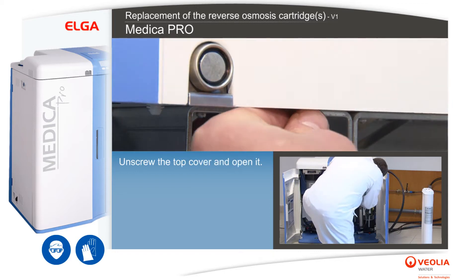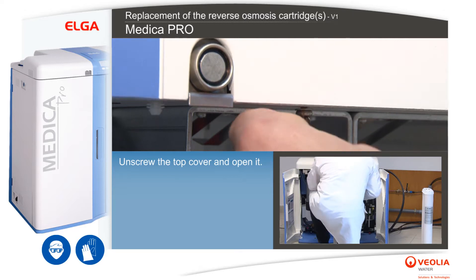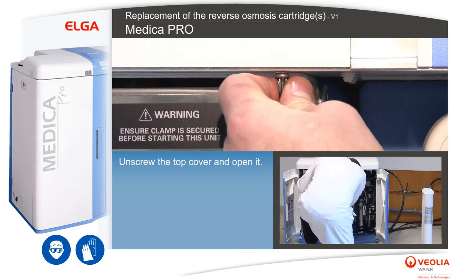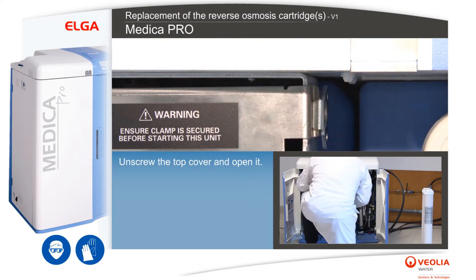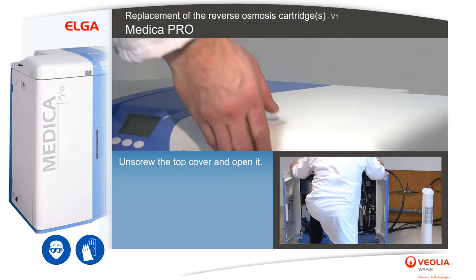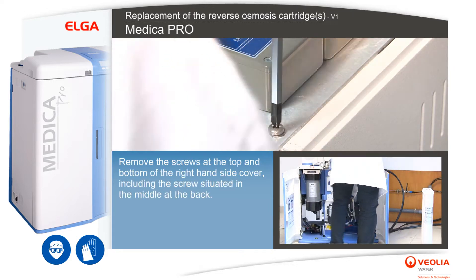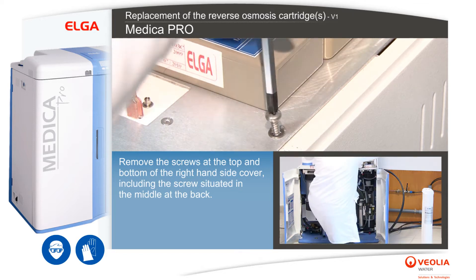Unscrew the top cover and open it. Remove the screws at the top and bottom of the right-hand side cover, including the screw situated in the middle at the back.